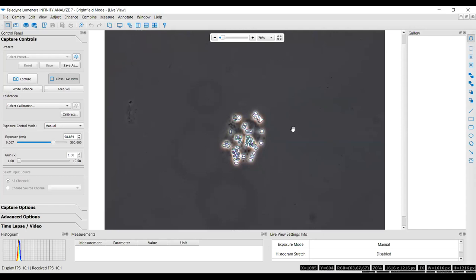Yeah, pretty much. Someone asked a question about counting the Microcystis. I try to explain what I do using the Whipple grid and moving the grids on the colony. I don't know if I described it well enough, but for stuff that's got a lot of cells, I certainly don't count them individually. You break it up into smaller unit chunks. Right, an estimated density. It's an estimate. Yeah, it's an estimate. I'm pretty close.